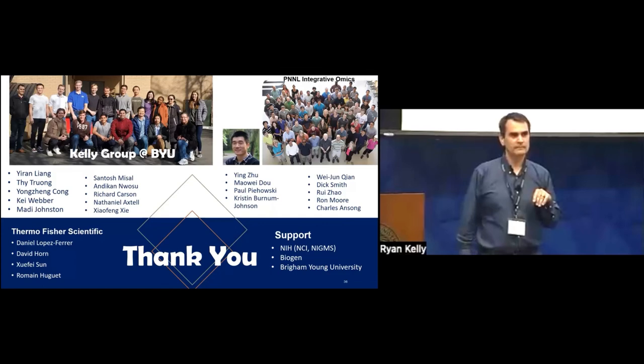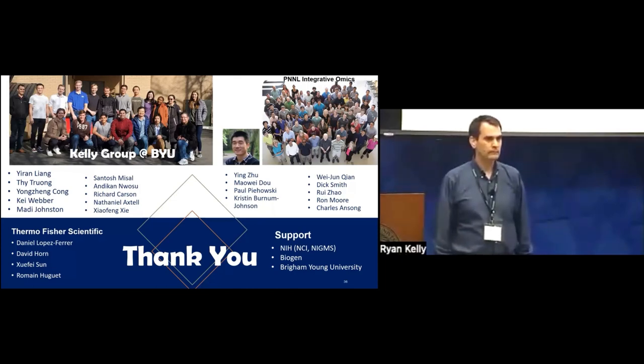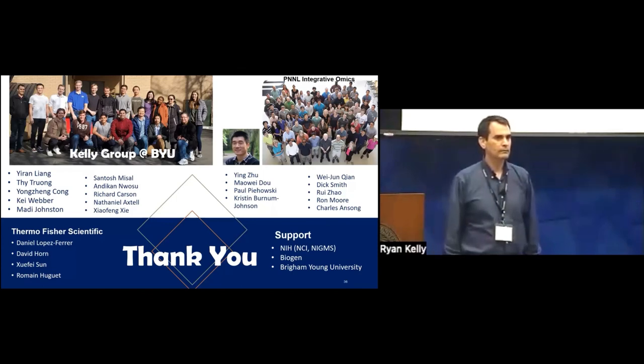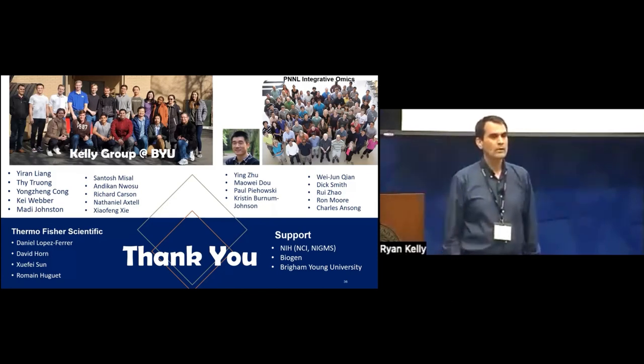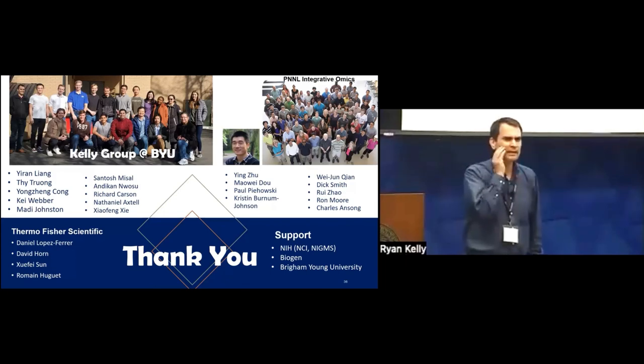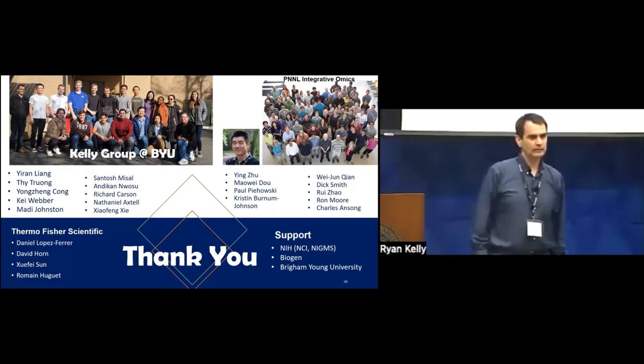Yeah. And then for the CV and the reproducibility measurements, they look really nice. It could also be interesting to show similar plots, to the extent that peptides might be independent measurements, showing correlations between different peptides and the variability for peptides coming from the same protein, which I actually know looks awesome in your data. Can you explain that a little bit more? With the technical replicates, it's not amenable since it's the same sample.